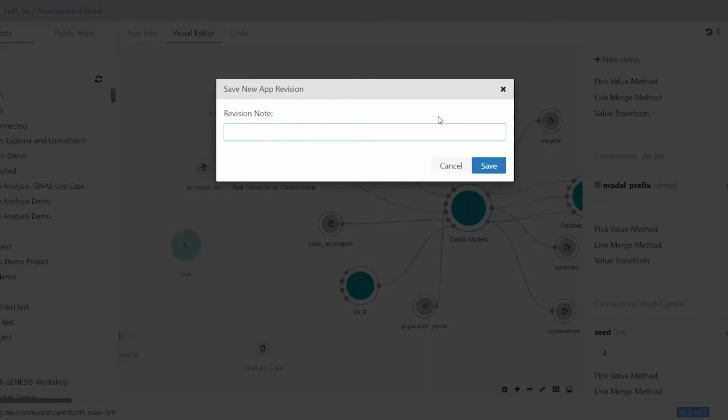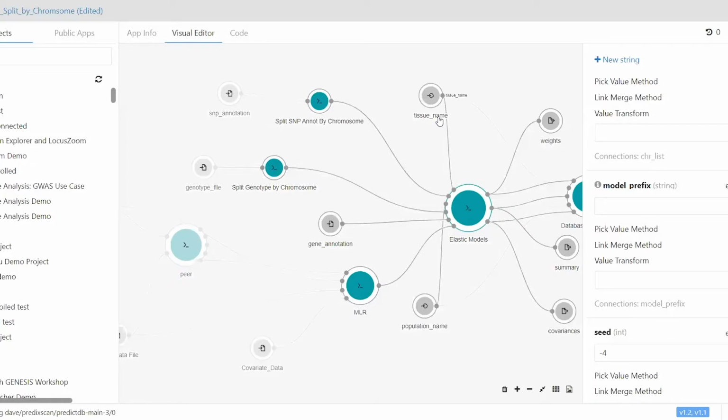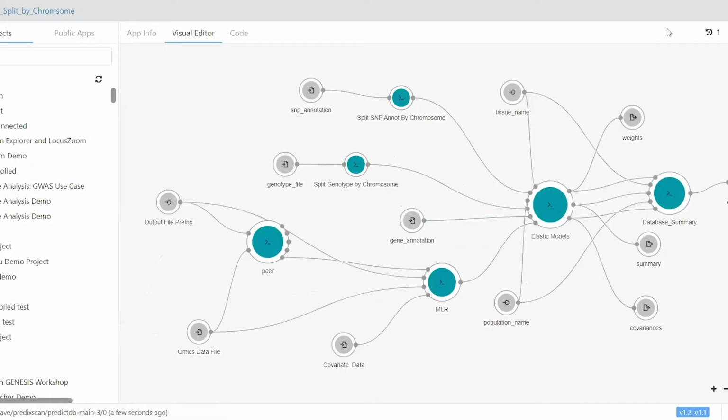So you have multiple layers of control. You have it here, you'll have it on GitHub, and that'll be mirrored on Dockstore. I'll just say I changed a specific parameter. Okay. And then I click export. I can export as YAML or JSON. There's a command line version of this, which is a little bit more complex. We don't have time for that in this demo, but if you're interested, you can do this all using the API and a command line tool called SBPack.